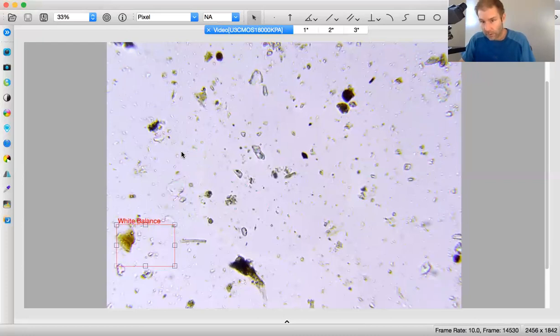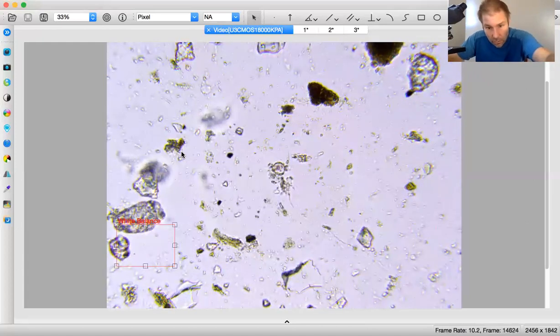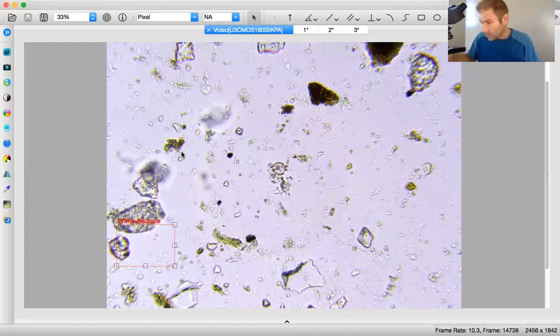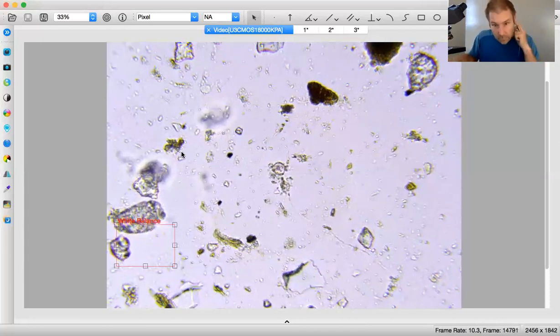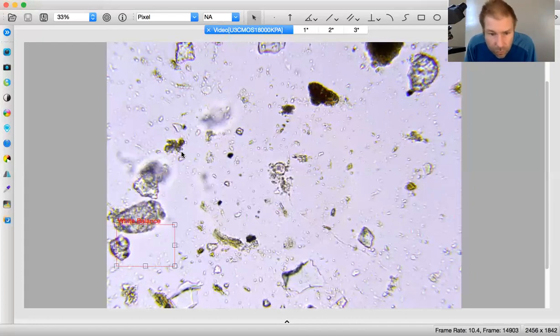So moving forward here, area number 2. Ooh, there's some actino right in the middle. 2, 3, 4. I'm getting 4 on that one. So that's a 0.4 actino. I might put that in my lap so I don't shake the table. I don't see anything else happening here.